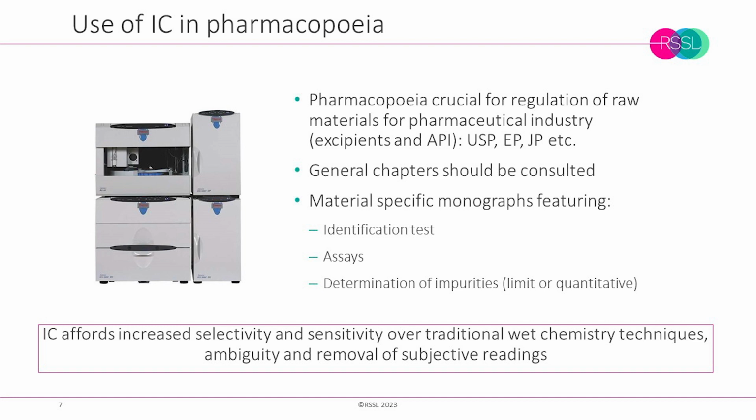Ion chromatography, on the other hand, is ideal for the separation and detection of ions and polar molecules, both organic and inorganic. It has the capabilities to analyze from small molecules to larger biomolecules like organic acids, carbohydrates, amino acids, peptides, oligosaccharides, and proteins. This makes IC the ideal extension of HPLC, increasing the analytical capabilities of the modern laboratory a lot. IC has been applied to all aspects of the manufacturing and disposition of pharmaceutical products, including characterization of active ingredients, excipients, impurities, raw materials, and formulated products.